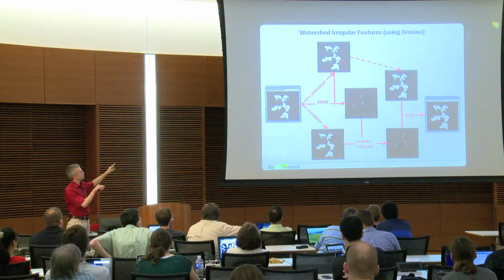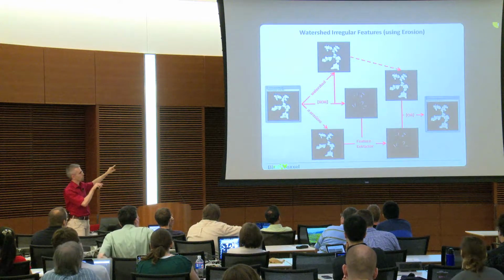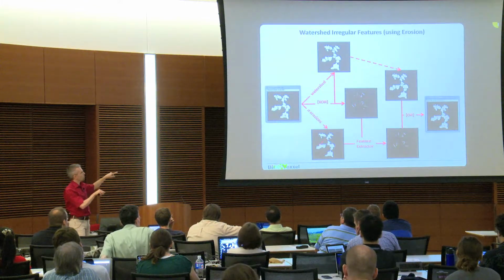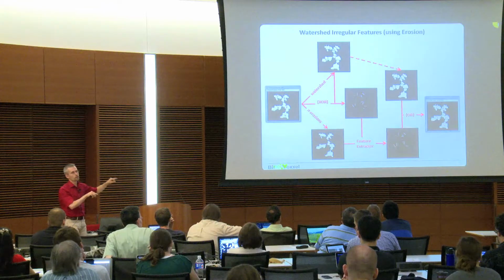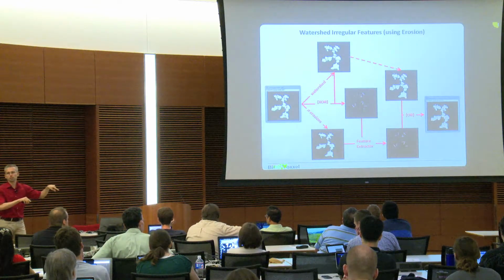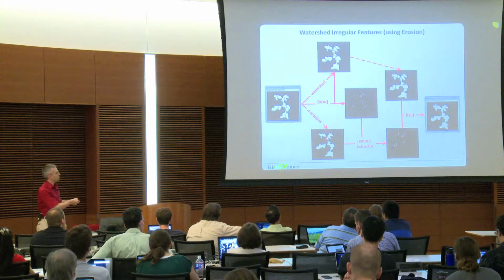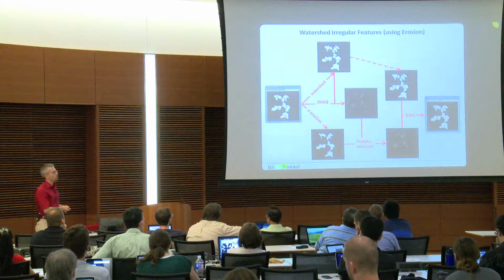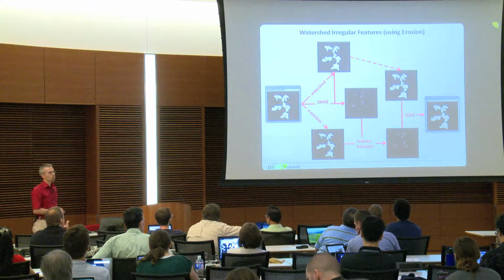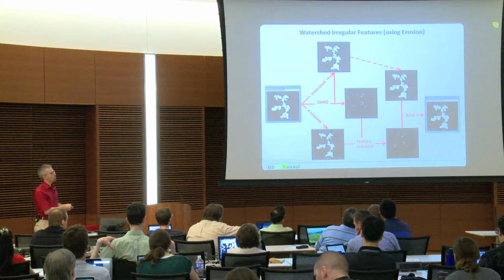It first extracts those separation lines by comparing original and separated ones. Then it says, okay, if those separation lines are still lying in an area where there is a particle still, then I don't want to separate that. But if there is an area in between where there is no particle anymore, then use it and separate it. That is basically what it does. Then it separates it only here.